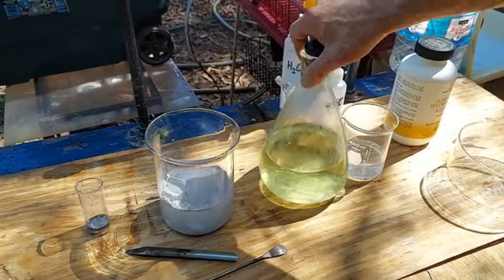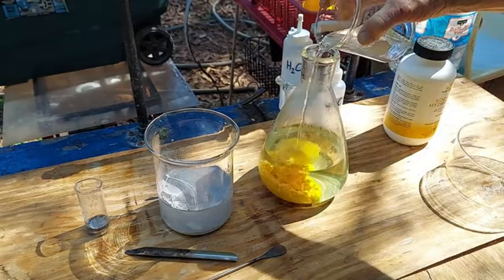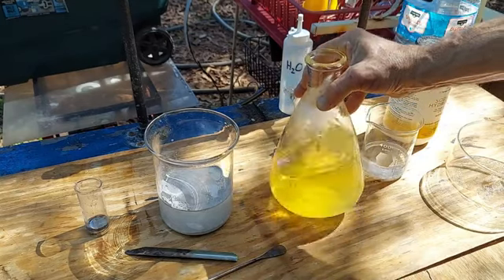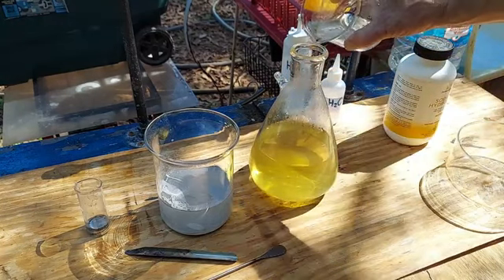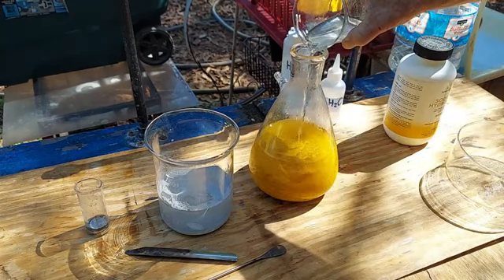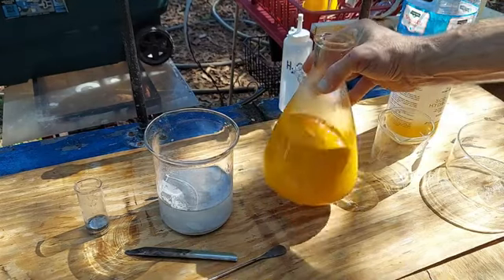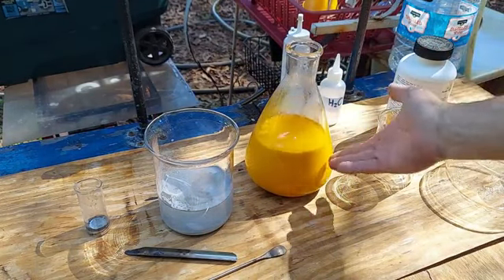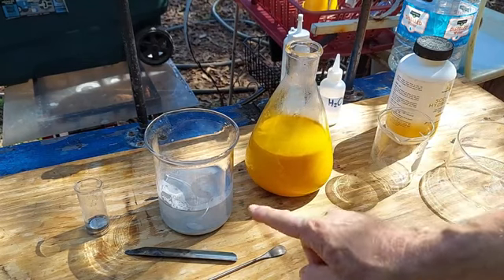This is the filtrate. What I'm going to do with this is just add alkali to it and drop out the mercury that remains within the filtrate as mercuric oxide, like so. That's very simple and straightforward. There really isn't a whole lot to see. We just add in alkali and precipitate it out like that. Now I've got to filter this mess. Yay. So, I mean, that actually looks really clean. Nevertheless, I am curious about this.